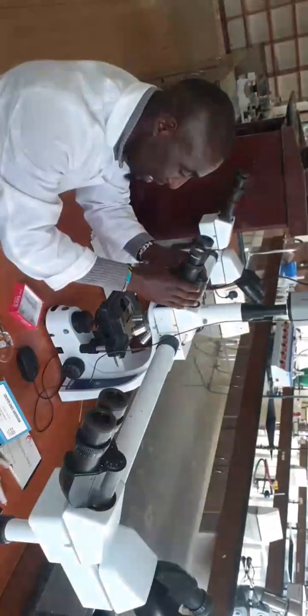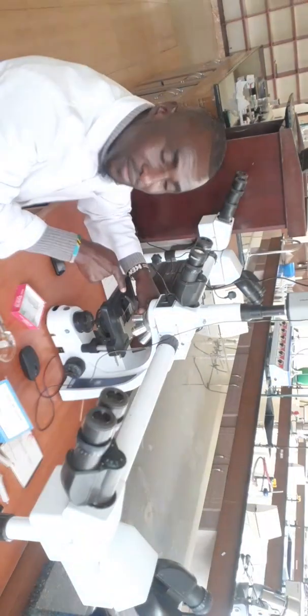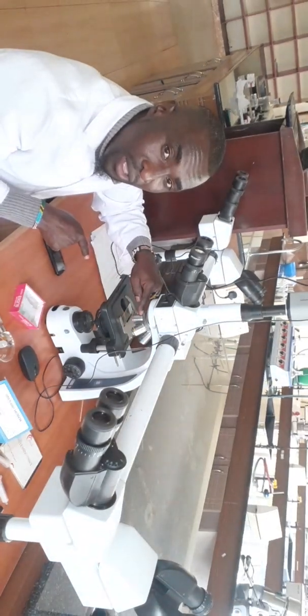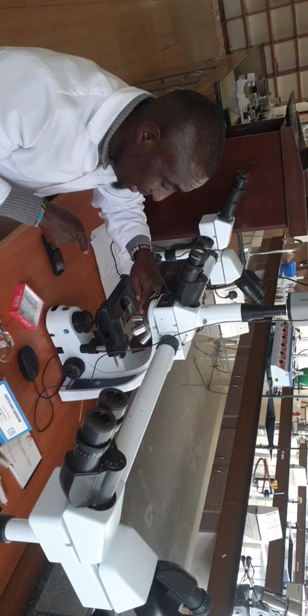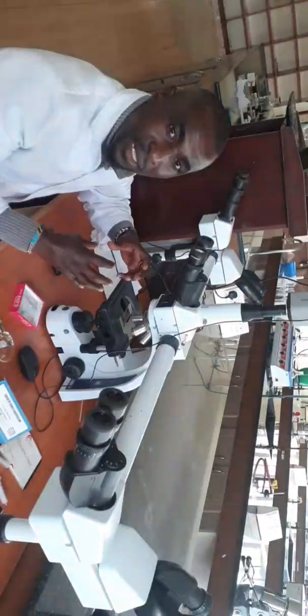So the objective lenses are of different types. The red one you can see here is the lowest power, and the low power is used to bring the specimen into primary focus at the very lowest power.